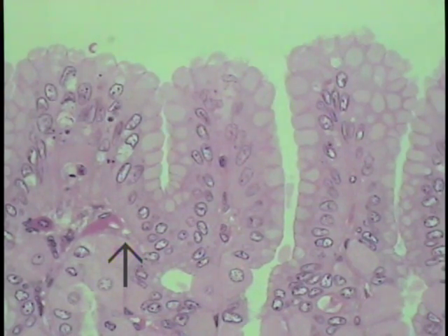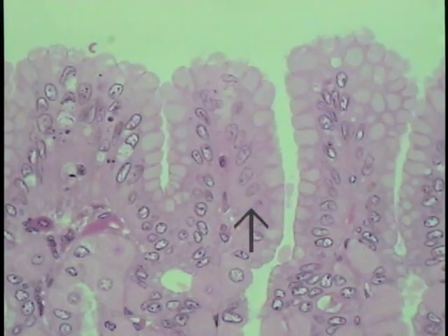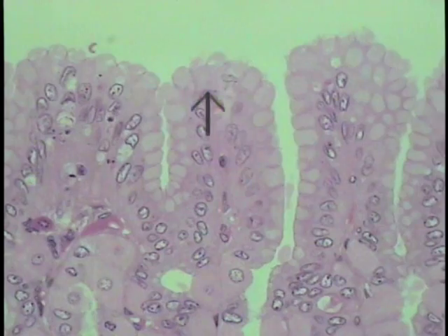The gastric lining epithelium, as seen at increased magnification. That simple columnar lining epithelium, though it's cut at a bit of an angle here, as indicated by the pointer. And the mucin granules, non-stained mucin granules, are shown at their apices. So this is the gastric lining epithelium, a rather unique epithelium found nowhere else in the body.